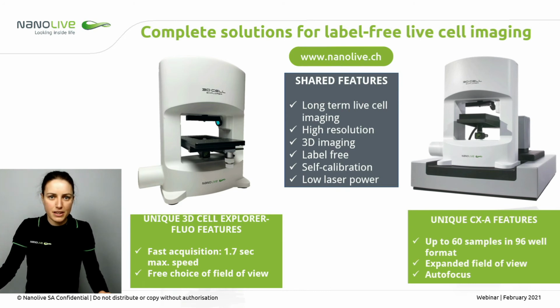In some cell types they're long and elongated, in others they're more spotty and discrete. However, we have to be aware of the fact that the mitochondrial morphology is directly related to their metabolic activity during that experiment. So that can also change across time within a cell type as well.